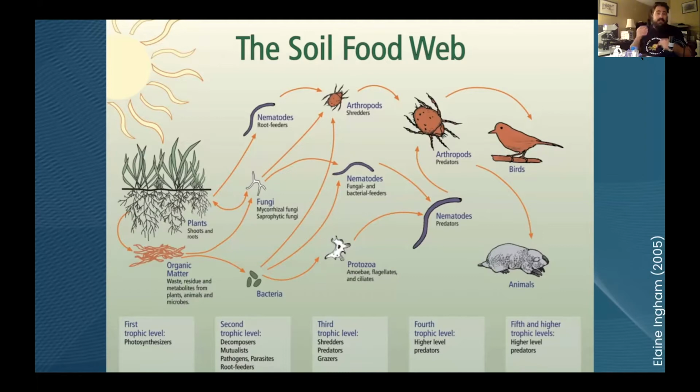A lot of the techniques by which you can look at aquatic microbes in the microscope, you can apply to the soil microbes, but you have to resuspend them in a water solution. I have this little kit here; we'll go over the details for the workshop component. For the sake of microscopy, it's very similar: taking a sample and putting it onto a slide based upon how much dilution there is to the biological material and the organisms in the sample.